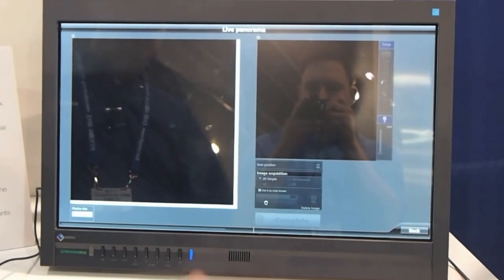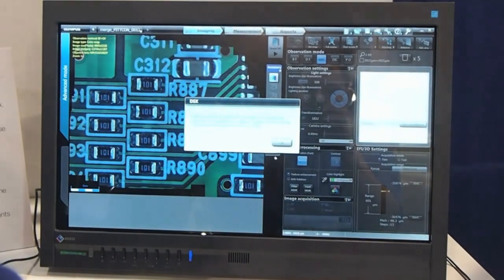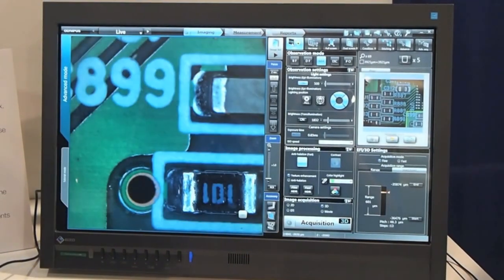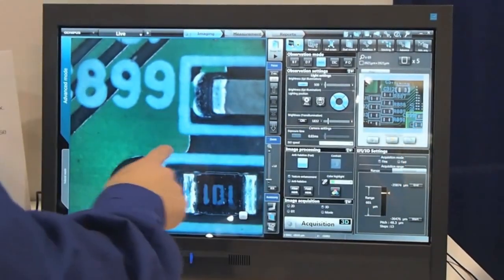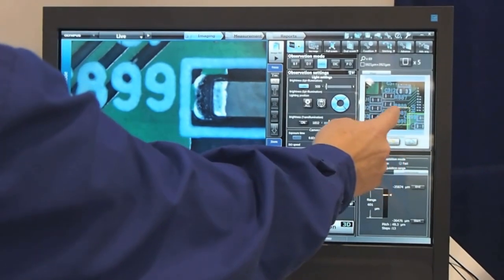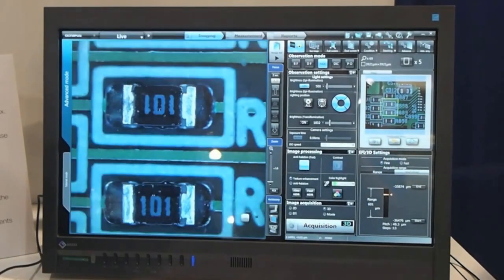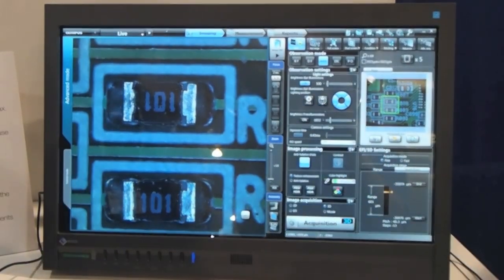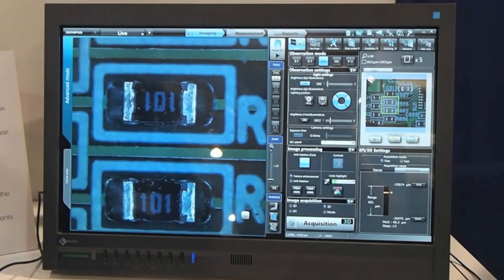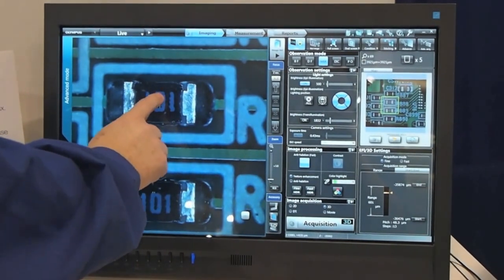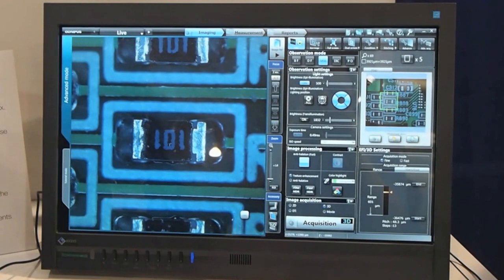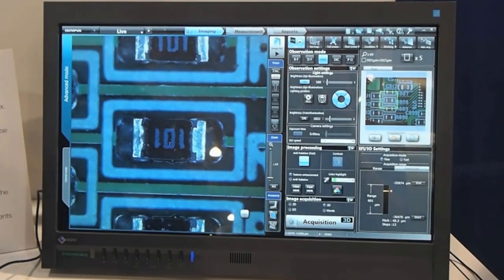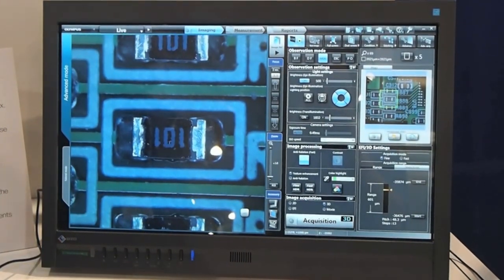Returning to camera mode, we can see where the camera is on the map. We can drag it to a region of interest and the microscope moves to show that specific feature. Using the touchscreen, we can double-click to center and pinch to zoom in and out on the sample.